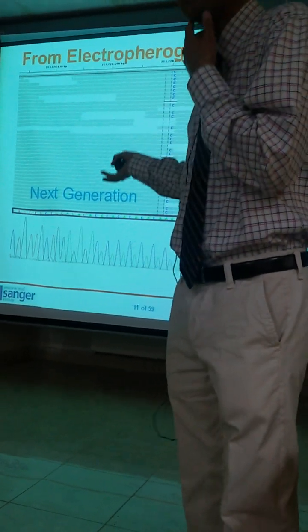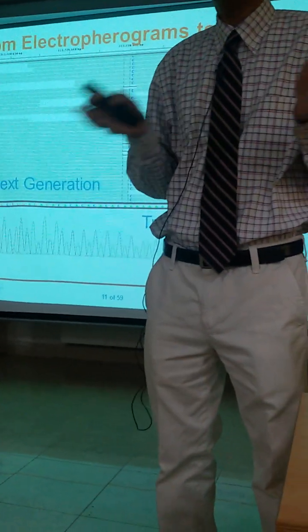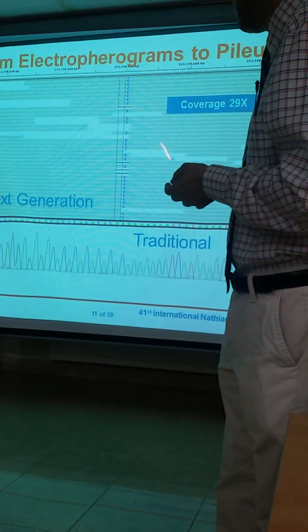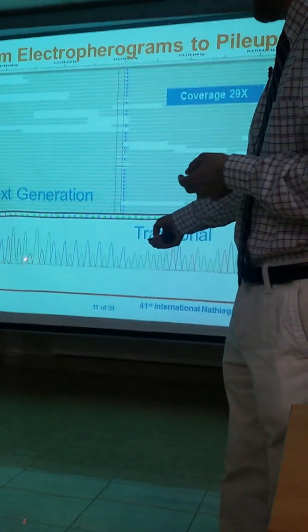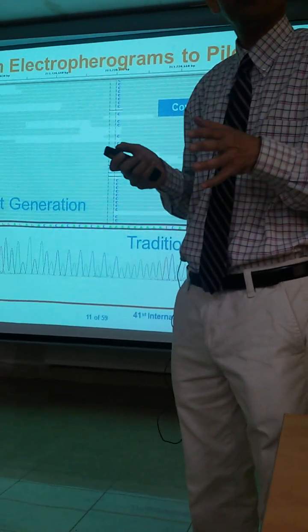I wouldn't call it next generation now because it's been there since 2008. Probably better to call it high throughput sequencing. So this is just actually the way it looks. So how many of you have actually done Sanger dideoxy sequencing?